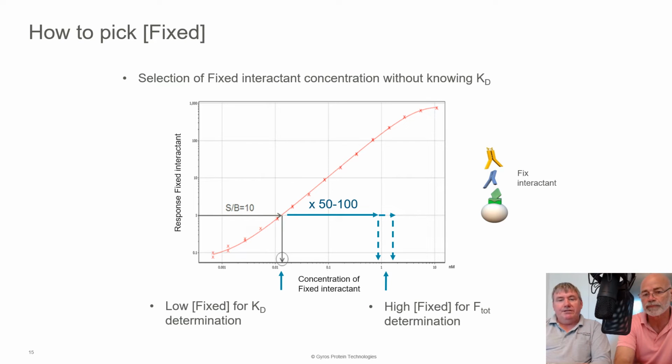Yeah, the software will allow you to run affinity curves and actually pool the data and visualize all the data from all the fixed concentrations. Because I know from some of the training sessions we've done, the more fixed concentrations you can choose, the more chance you've got of determining the KD first time. Exactly.